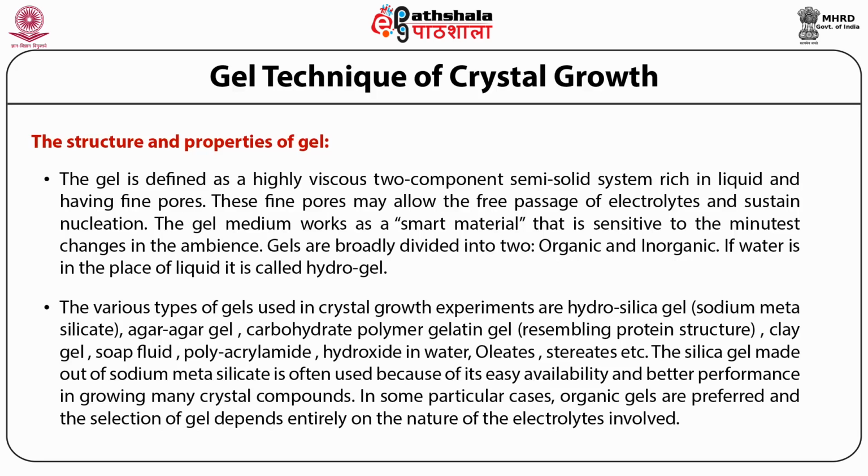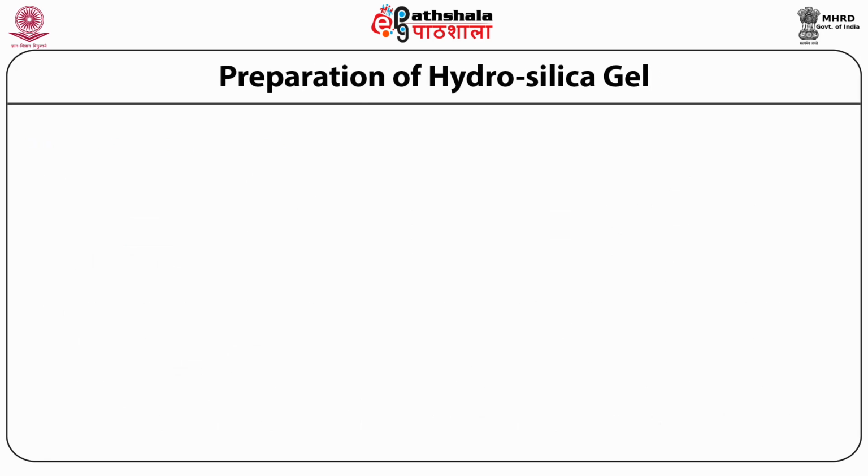In some particular cases, organic gels are preferred, and the selection of gel depends entirely on the nature of the electrolytes involved.